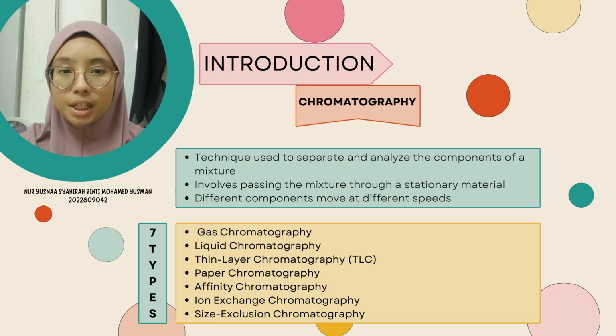Now, I'm going to begin our topic by providing a clear explanation about chromatography. What is chromatography? Chromatography is a technique used to separate and analyze the components of a mixture. It involves passing the mixture through a stationary material, like a column or plate, while a fluid, liquid or gas carries the components through. Different components move at different speeds, allowing them to be separated and identified.